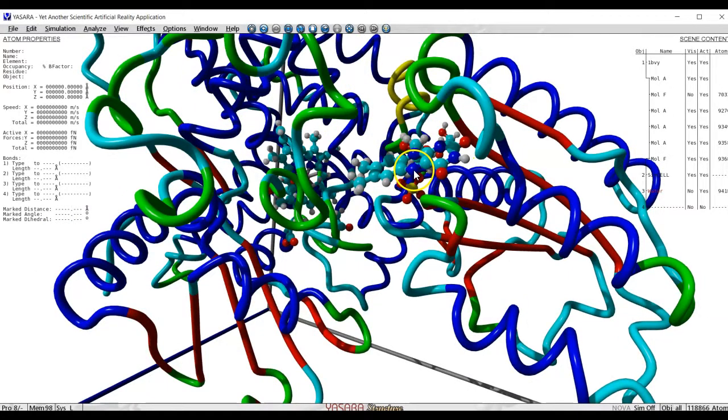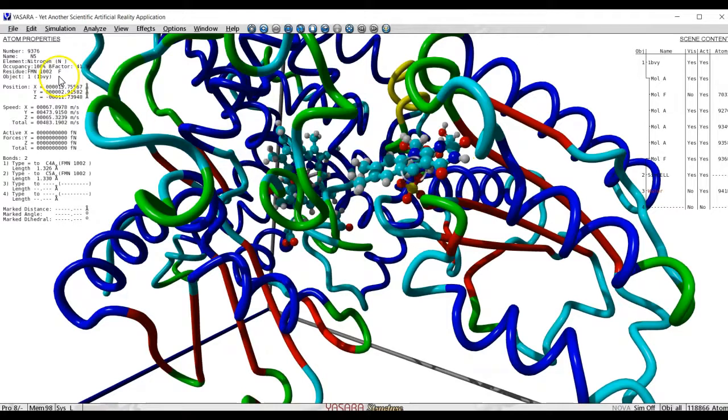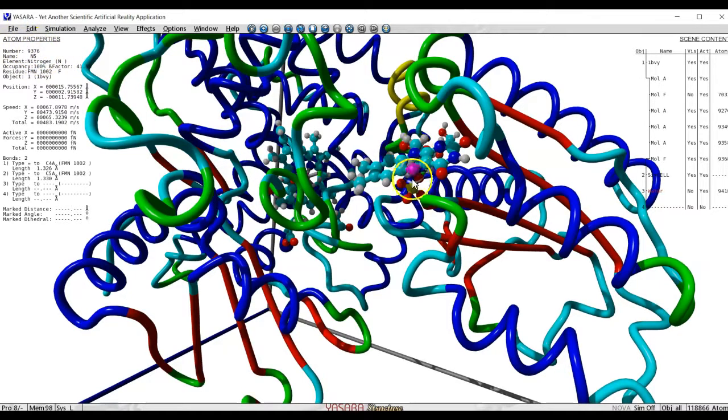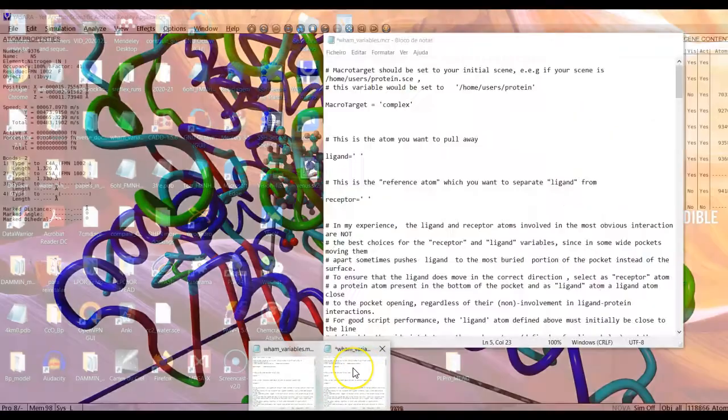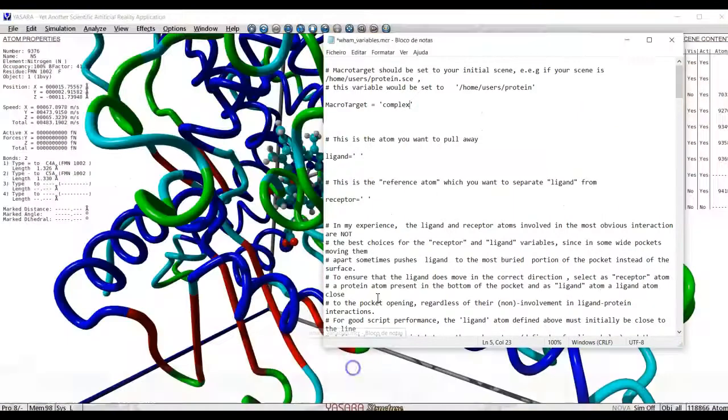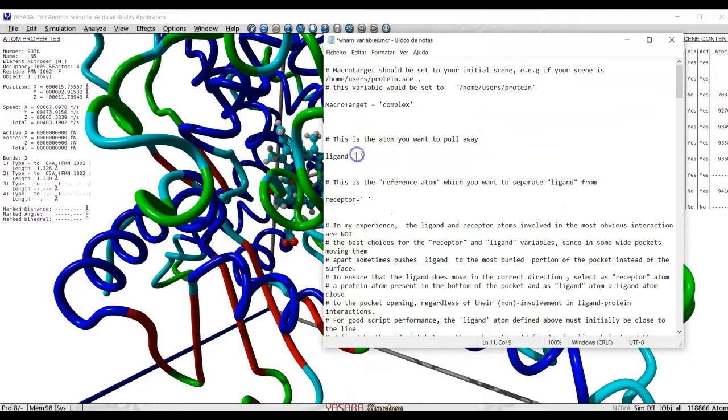I will try to move away this atom. This atom we see here is 9376. So this is the number we write at the ligand region. So here we do it 9376.